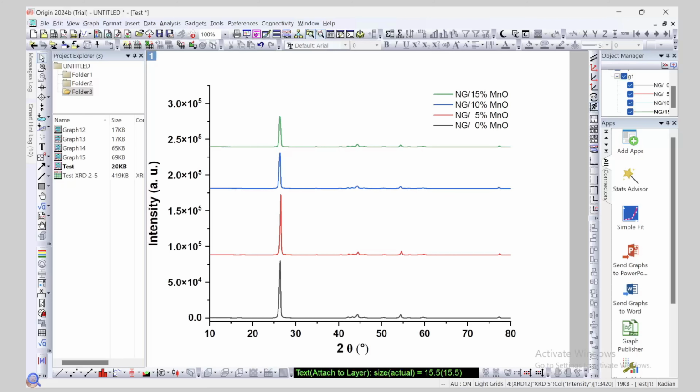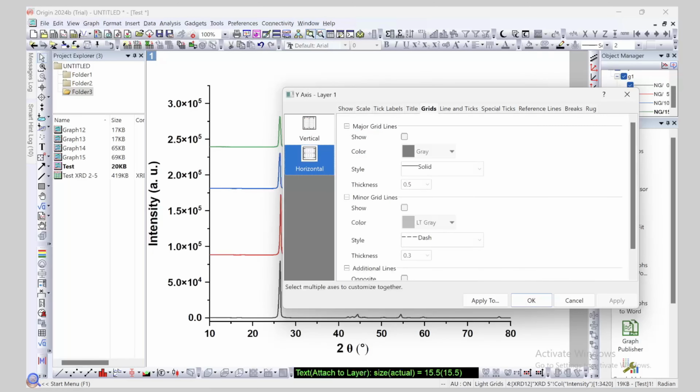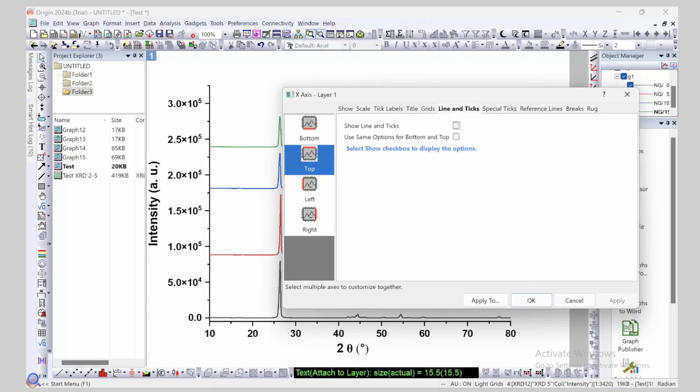So now the last thing is we now have to put a box here. So how do we put a box here? The best way is to double click on this line. And then we'll have this window popping up again. Go to grids, grid lines. Yes, here. So now since we clicked on the left axis, this is active. So now we'll have to go to top. So we have to create a top line.